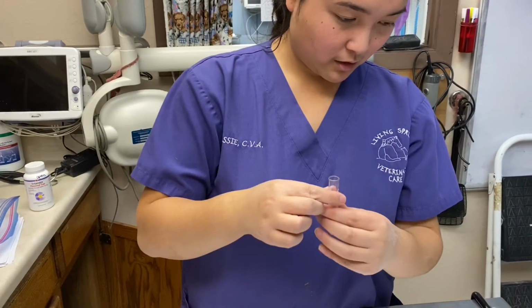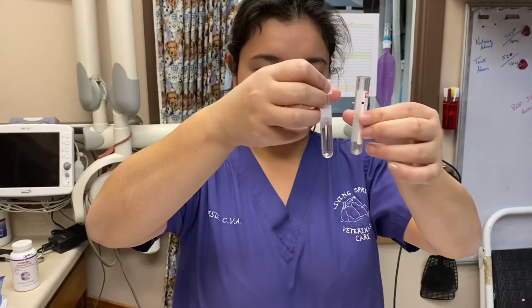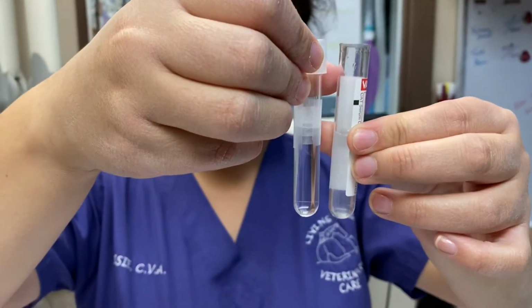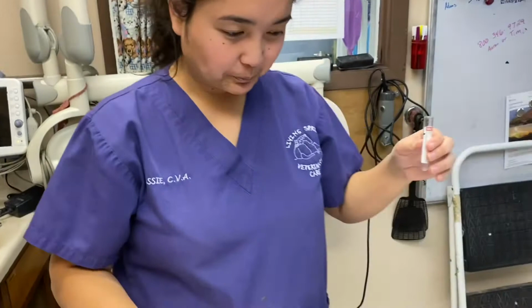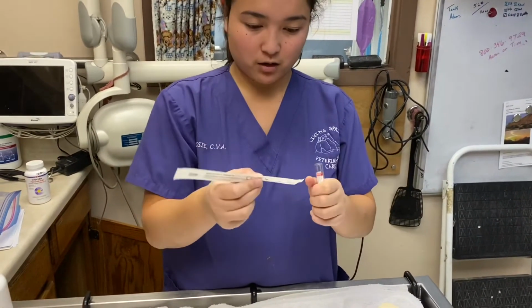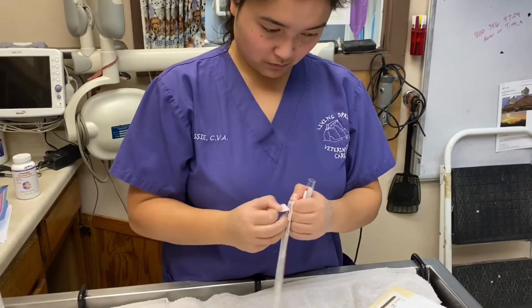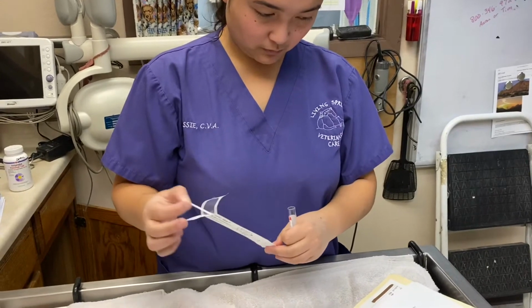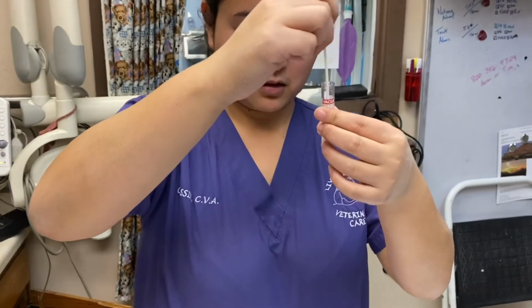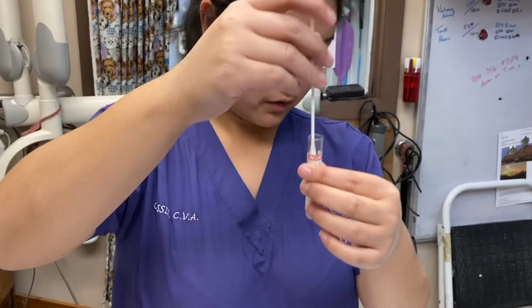So I'm going to compare the turbidity to my 0.5 McFarland. It looks like it's pretty good in clearness. After that, I'm going to grab my sterile cotton swab. Alright, I'm going to dip it in the tube and then get some of the excess water out of there.